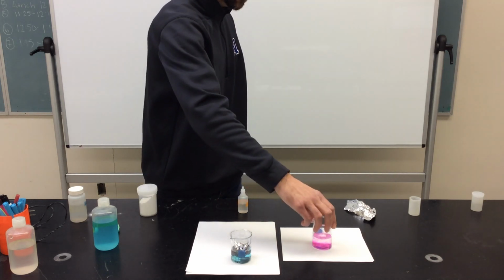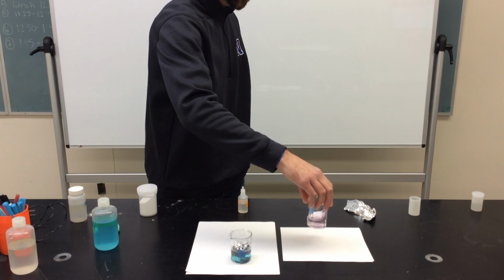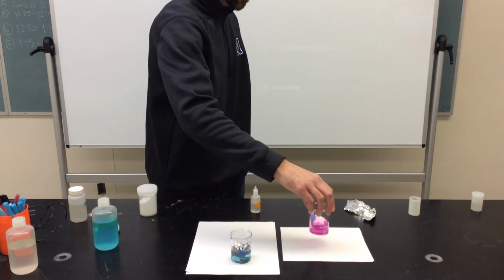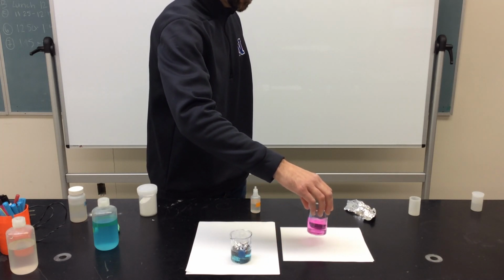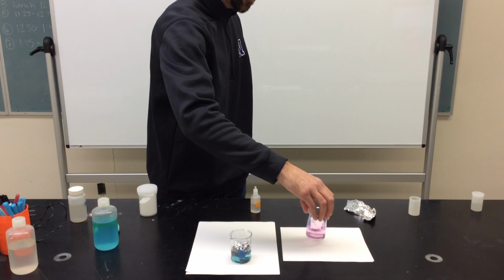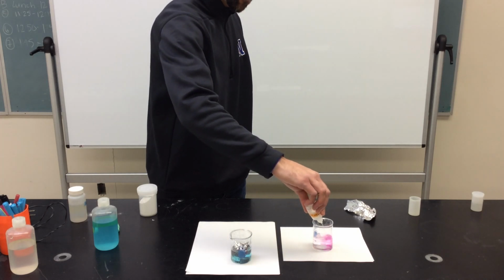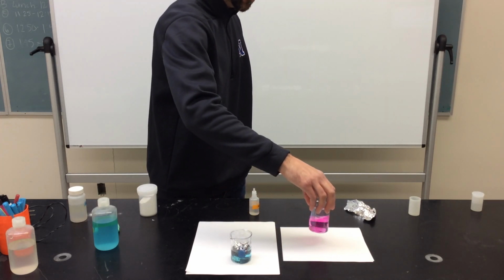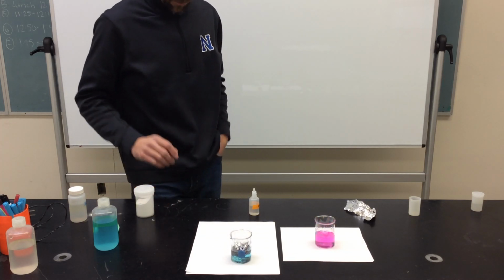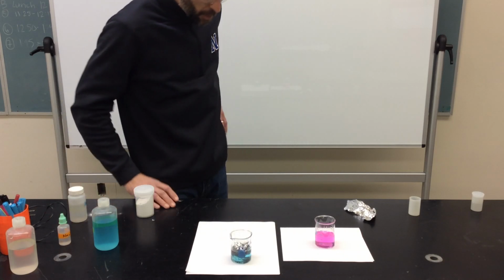Give another squirt. Doing a magic swirl. Oh, there it goes. It's gone again. Another squirt. Oh man. Is it gonna go? One more time. I think this might be the one. Yep. Okay, now it stays purple or pink or whatever color that is. I'm actually kind of colorblind, so I'm not that good with colors. But it stayed that time.